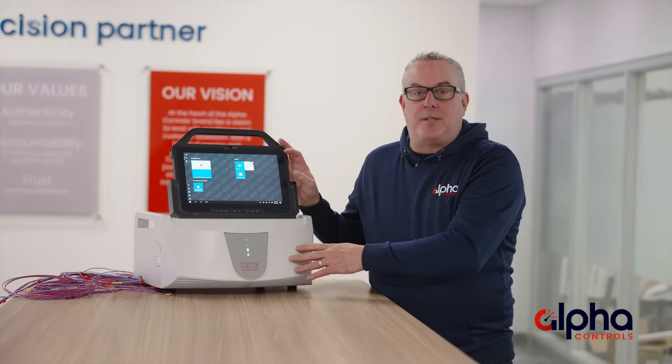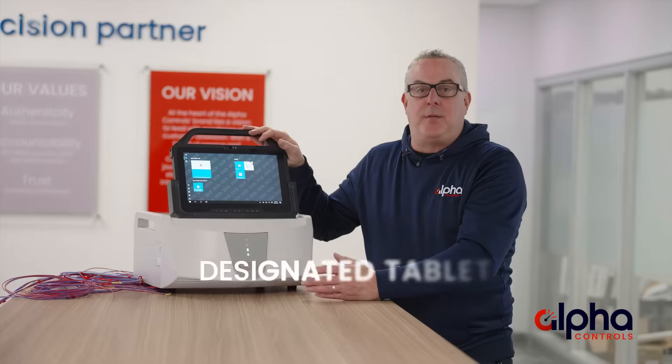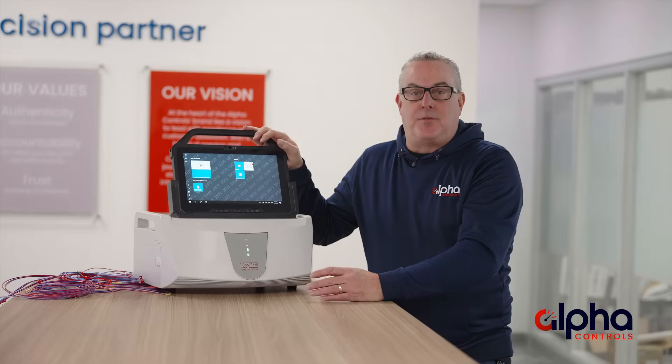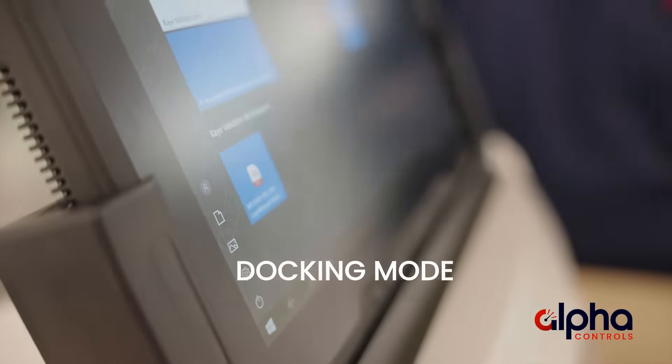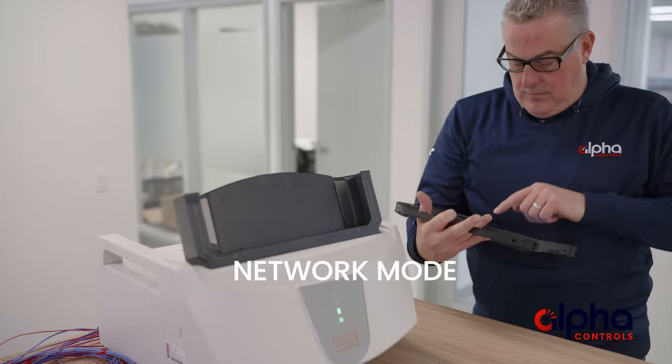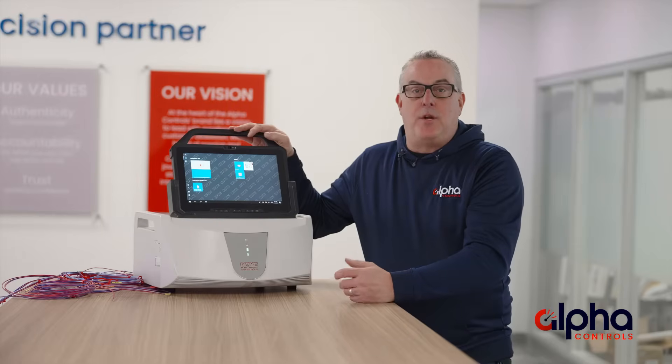This device is a standalone system. It comes with a designated tablet that has the AVS software installed, which eliminates the need for a computer. The touchscreen interface can be used in two ways: docking mode where it's connected directly to the system, or network mode where you can detach it and use it wirelessly, giving you the flexibility to work the way you want.